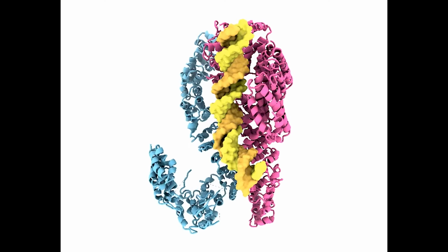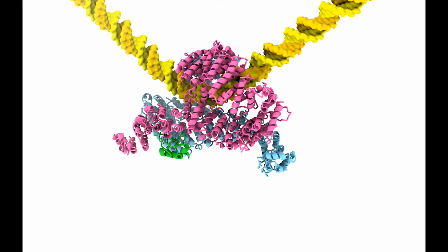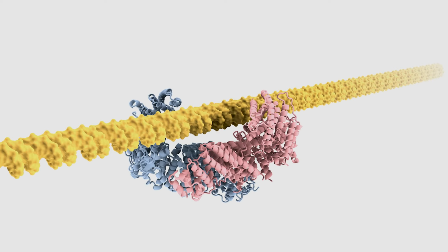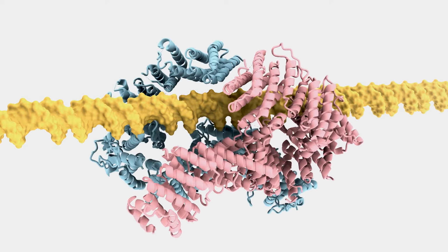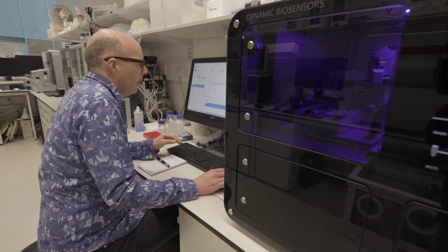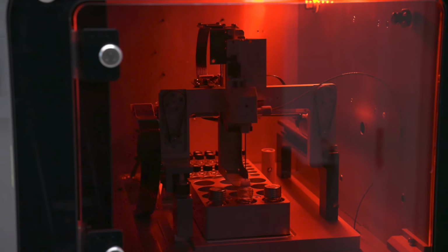What I'd be really proud of is one of the experiments that I did with Laurie Passmore's group, where we were looking at the affinity of a DNA clamp, which is there to clamp over DNA and search for DNA damage parts. Initially, when we were looking at the interaction by fluorescence polarization, it seemed to be very, very weak. And that didn't really make sense about how its job could be in the cell to try and search. So I actually used the instrument behind me called the switchSENSE, which involves DNA nanolevers.